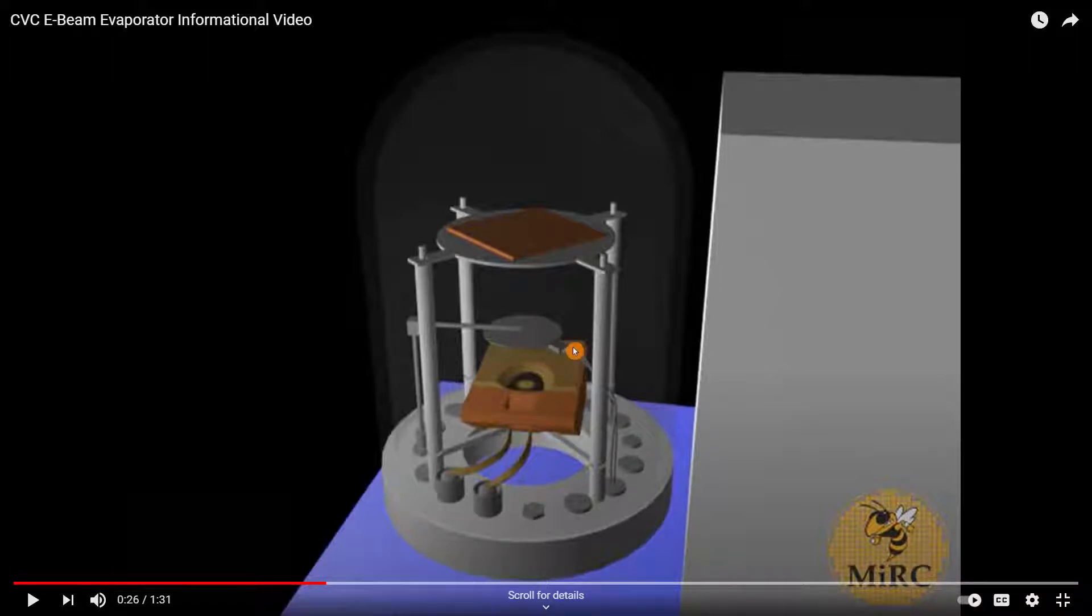This monitors the film thickness. You have a shutter that you can open and close. Your substrate is loaded on the holder on the top, and then the evaporation starts, going up and condensing as a film on the substrate.